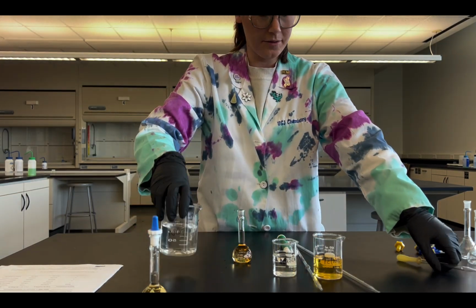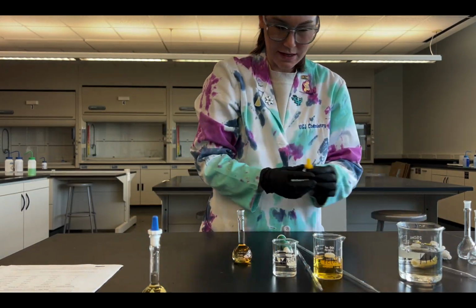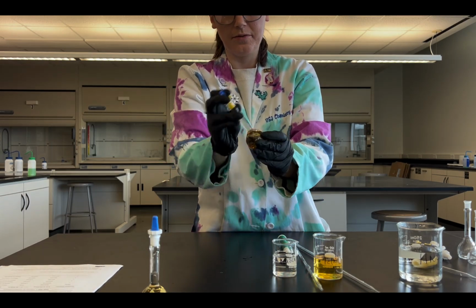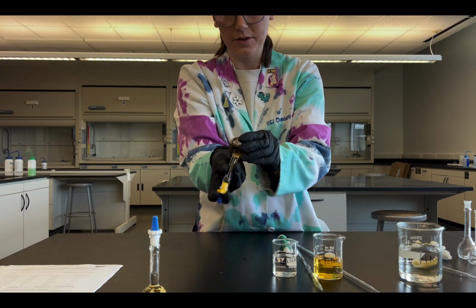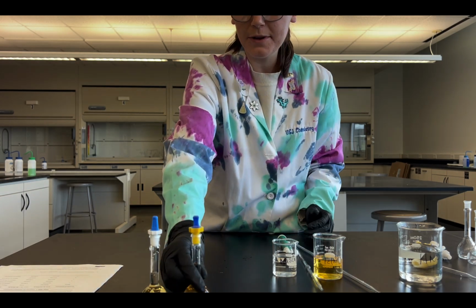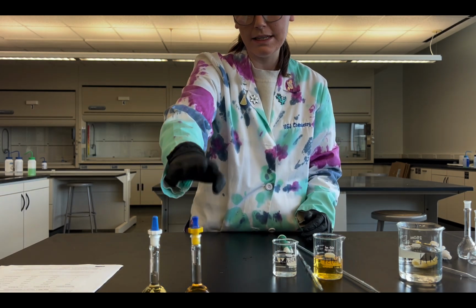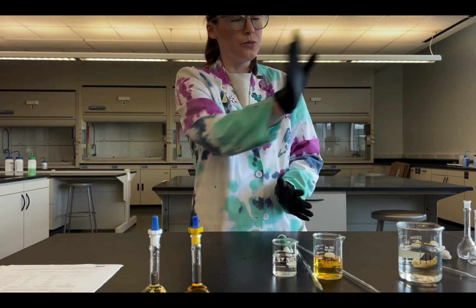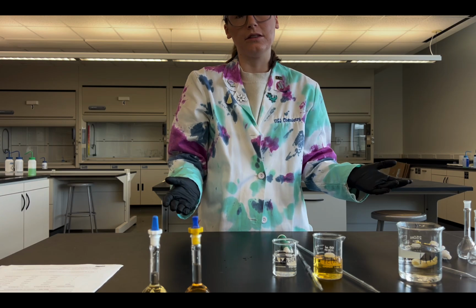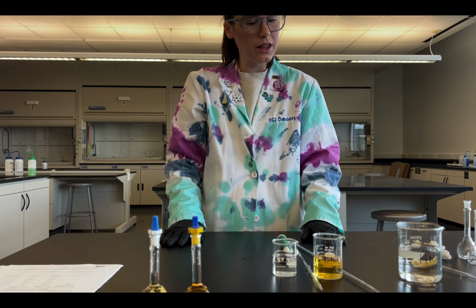Okay, we can cap this. And we can flip this upside down in order to mix it. Okay, so those are my first two solutions, my blank and test tube number 1. Now I'm gonna move these to a test tube just after I've made all of my solutions so that it makes sense that I'm calling them test tube number 1 and 2 and everything like that.